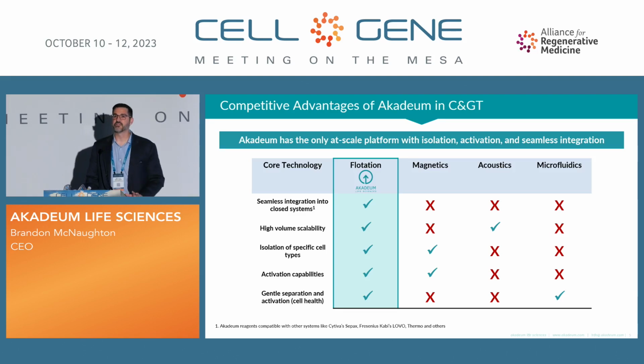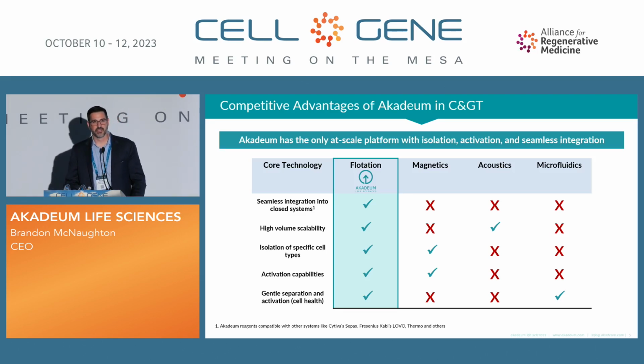Okay, so what does that do for you? What does it actually do for the user? Well, what I should ask is what was missing from the video? What was missing was anything to initiate the separation. So there was no magnet, which you can squeeze the cells under high magnetic forces. There was no acoustics to try to initiate a separation, and no transducers. And there was also no microfluidics. This can work because of the background of gravity, which initiates the separation.